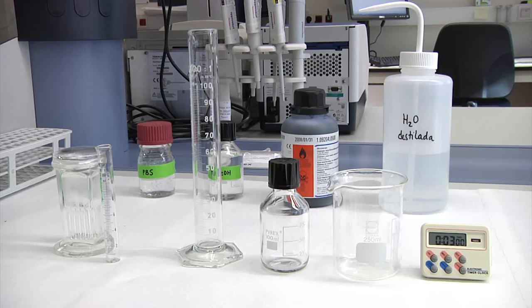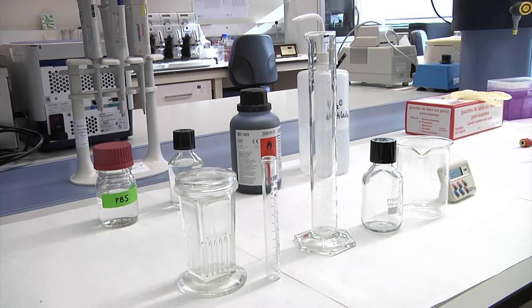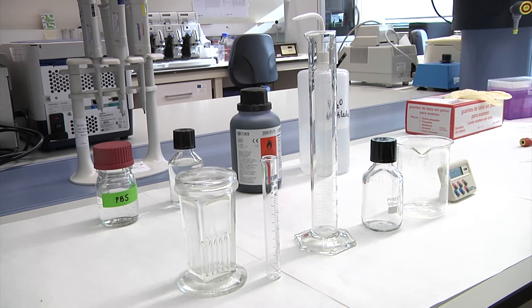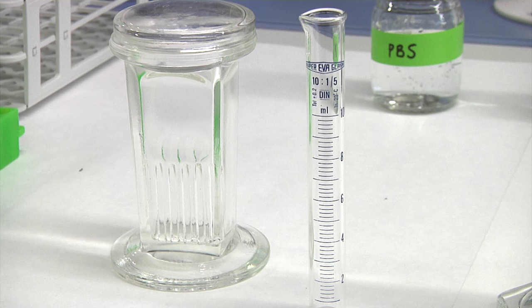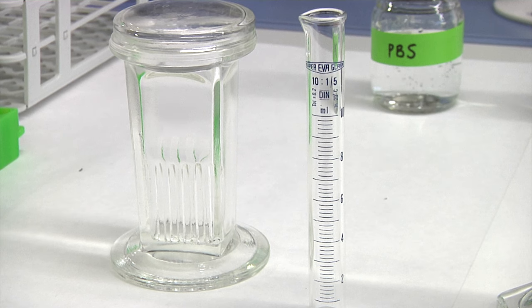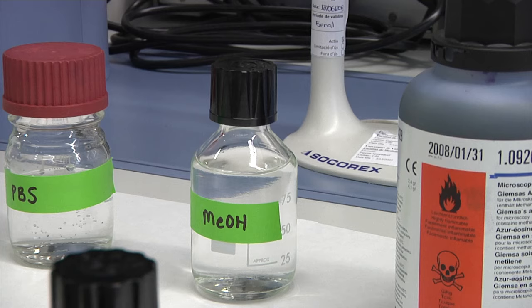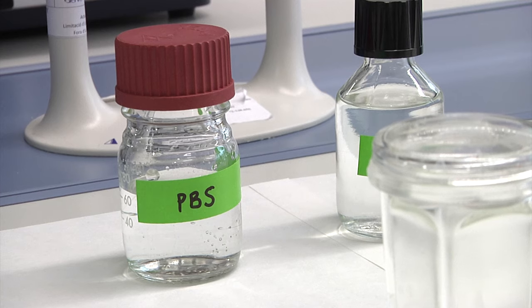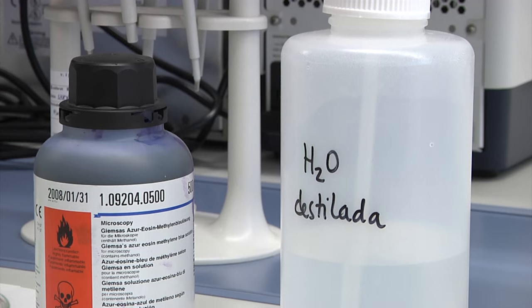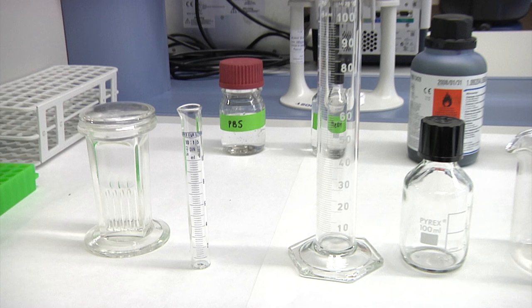Although there are different variations of the Giemsa stain, in this video we show you a very fast and simple protocol to perform it. We will need a bucket or crystallizer, methanol, Giemsa dye, PBS buffer, distilled water, and graduated cylinders.